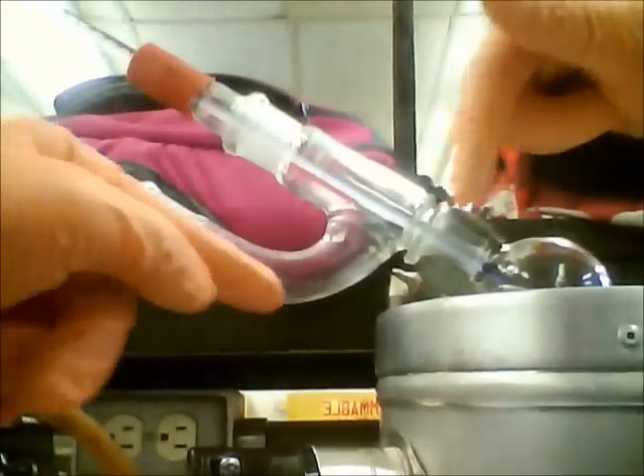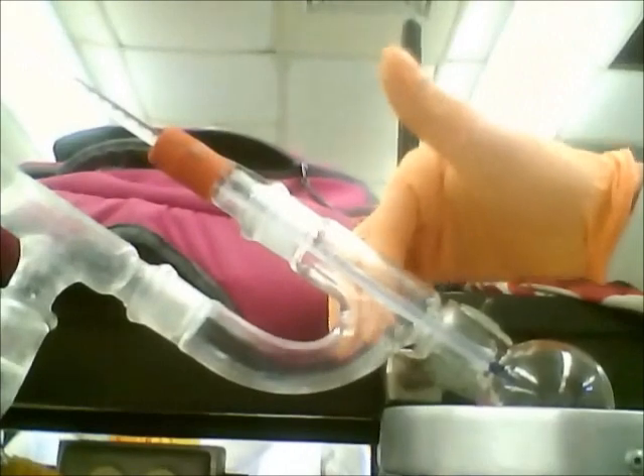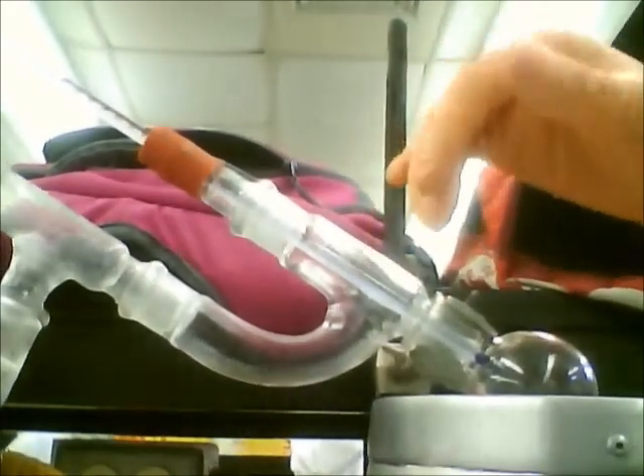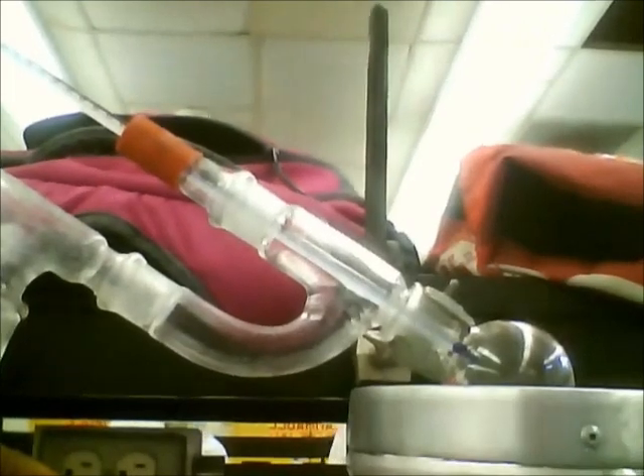We've got the holdup occurring right above here — the column of vapor pressure above the liquid before it recondenses back into a liquid. Right here you can start seeing some of the distillate forming. That was at approximately 63 degrees Celsius.